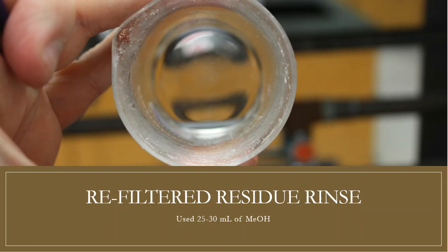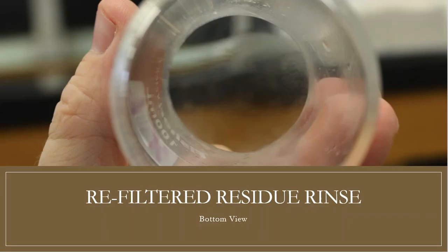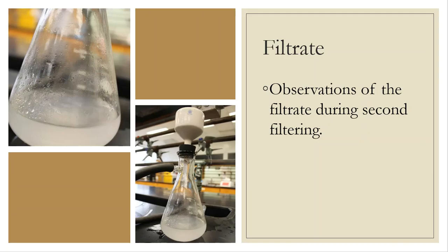And here is the top view now, looking down through the beaker. You can still see a little bit of remnant that's around these edges. I tried to get some of that stuff off, I just wasn't able to do it. And sometimes it can be a little stubborn that way. So here's the side view. Notice there's no crystal. What you're seeing here are maybe water droplets and condensation, because this stuff was ice cold, remember. But I'm looking for crystal here. There's very few crystals that are left over. And then here is just a bottom view looking up toward the top, and once more you can see that a lot of those crystals are just gone at this point. So I felt really good about that.